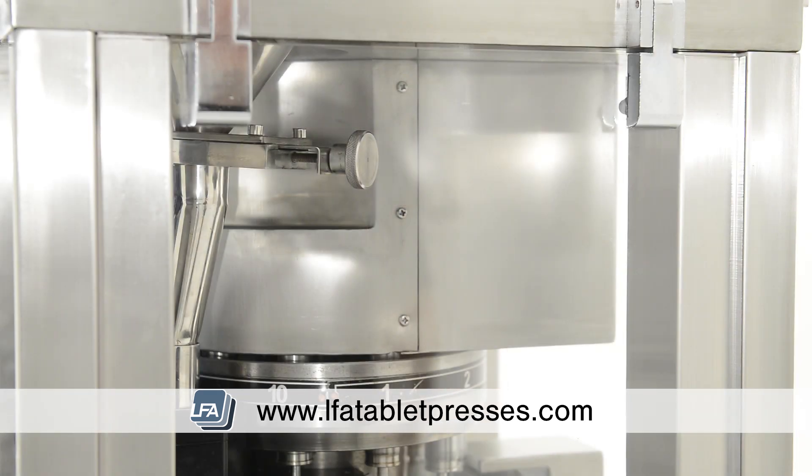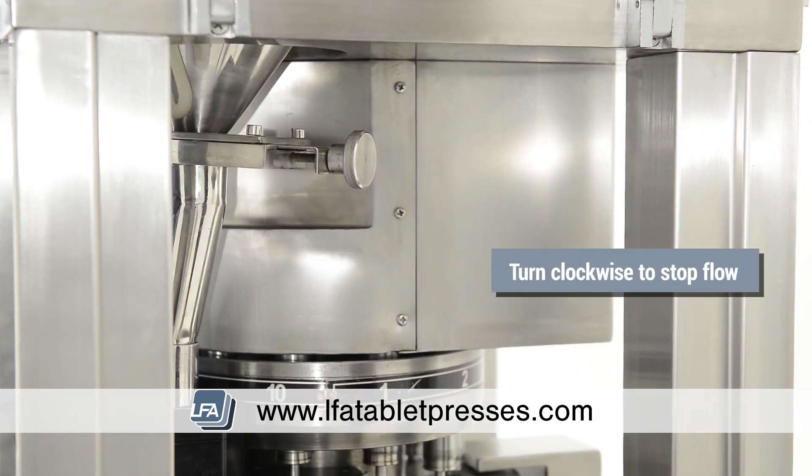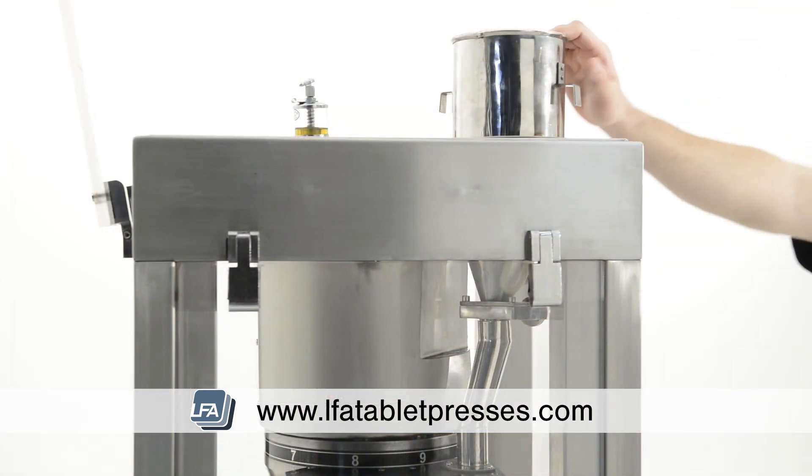First, stop the flow of formulation to the force feeder by adjusting the flow adjuster on the hopper. Turn this clockwise all the way in and this will stop the flow. You can now lift the hopper out the top of the machine.